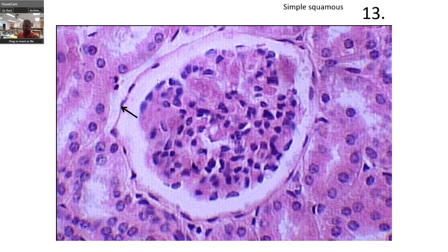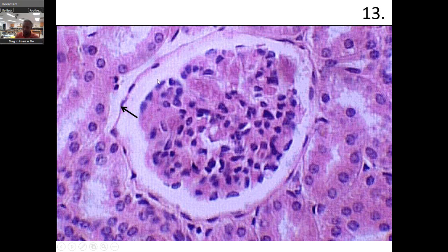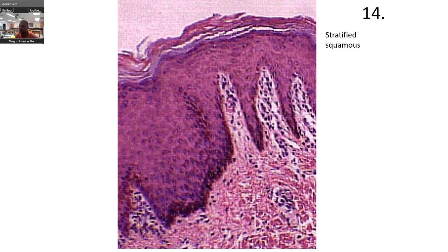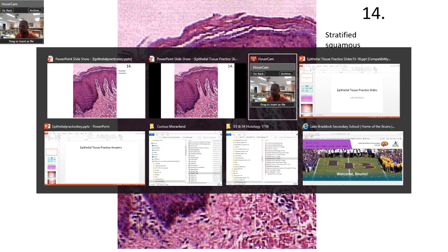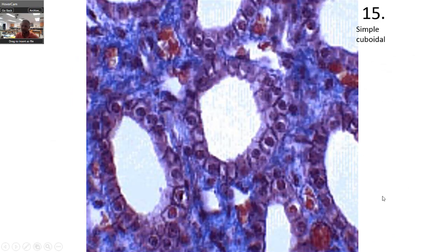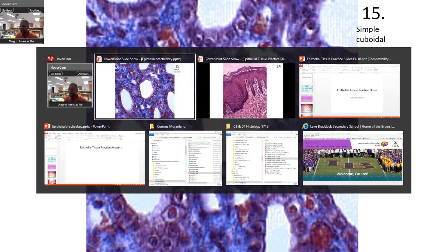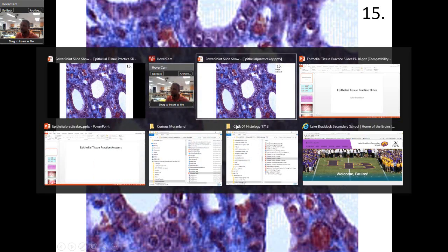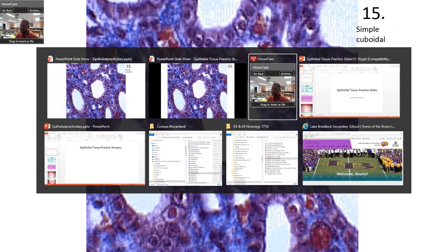This is another simple squamous. When you're watching this, I'm showing the unlabeled one and then going to the next answer — the answer has the previous one, so don't be confused. Pause the video if you need to. The next one is stratified squamous, and number 15 is simple cuboidal if you look over here.